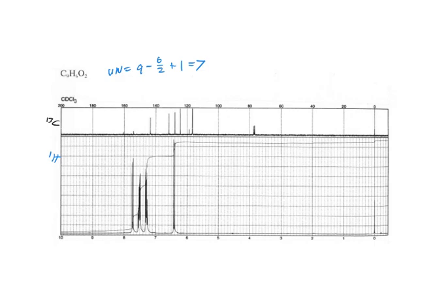Right, this is here. There's a peak here at just over 160, and there's the one here in the 150s, and that one, and then I would say this one. Those three, because they're so small, are likely to be quaternary.